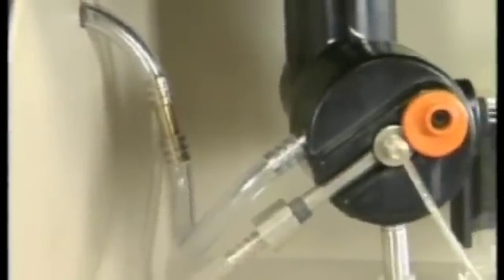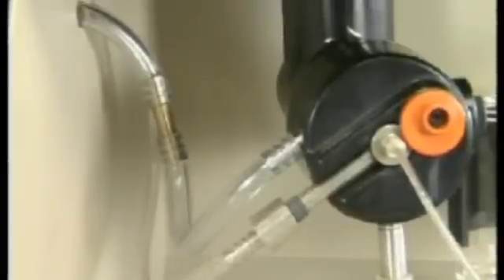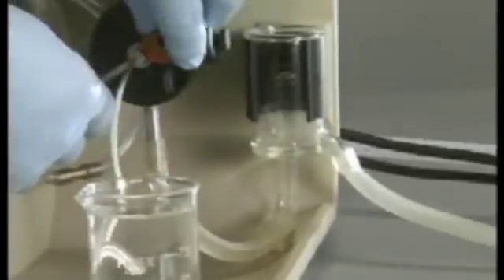The regulated air and gas supplies enter a nebulizer unit where they are mixed with the sample solution. The air flowing into the nozzle at the front of the unit draws solution up a thin tube and converts it into a mist.